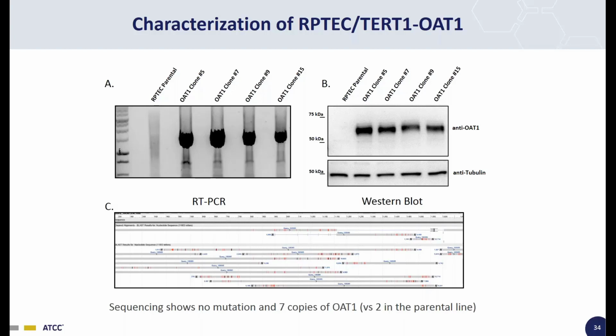One thing we need to point out is that in either figure A or figure B, the RPTEC parental line does not express OAT1 at either the mRNA or protein level. So this slide verifies that OAT1 is correctly expressed in the clonal cell lines.